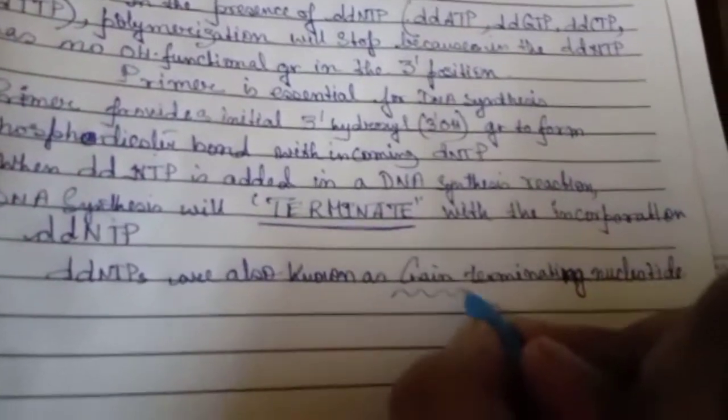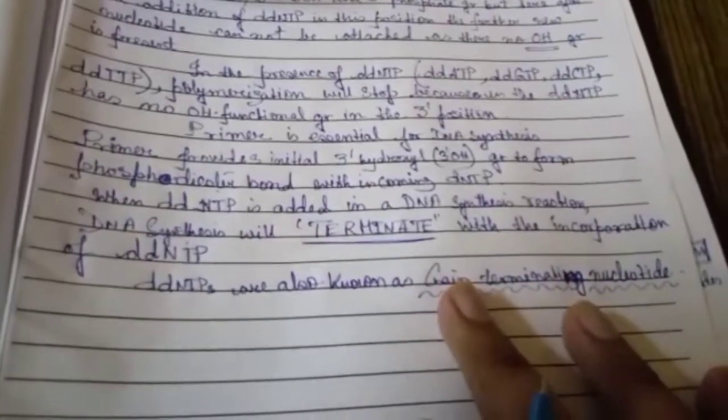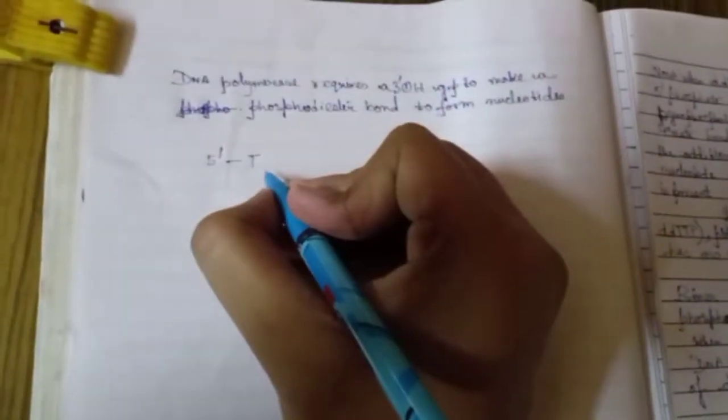And this is the principle of Sanger sequencing, or chain termination method, or dideoxy sequencing.